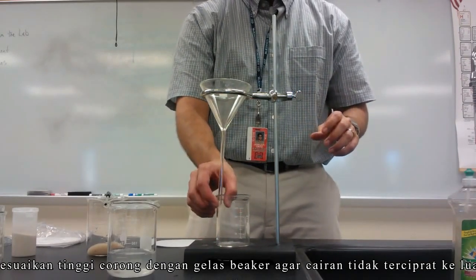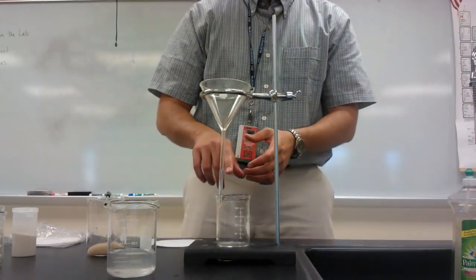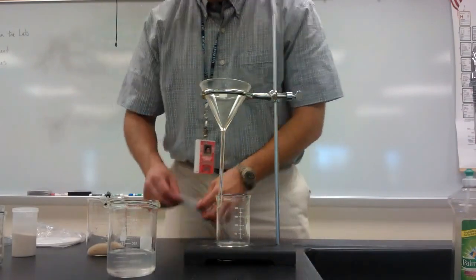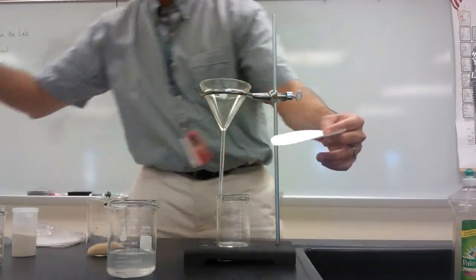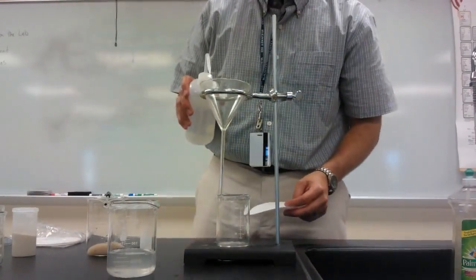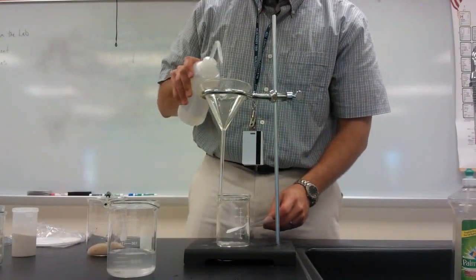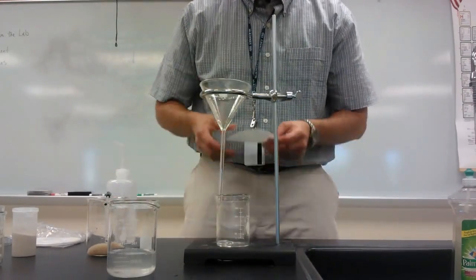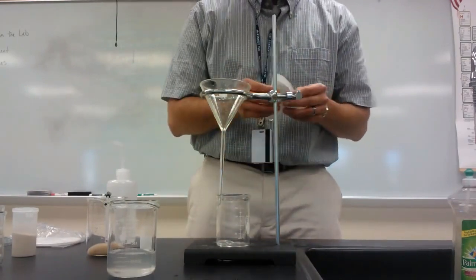What I want is for the liquid that begins to drip down to run down the wall of the beaker — I don't want it to splash. Now, setting up the filter paper: I'm first going to squirt my funnel with my wash bottle so that the filter paper will stick a little better. You can see there was no splashing. In this case, it's water on water so it doesn't matter.